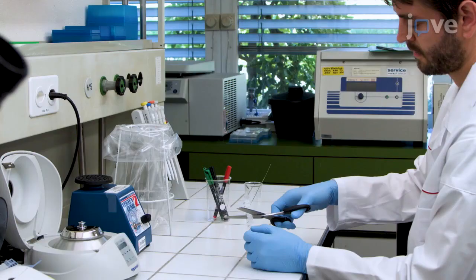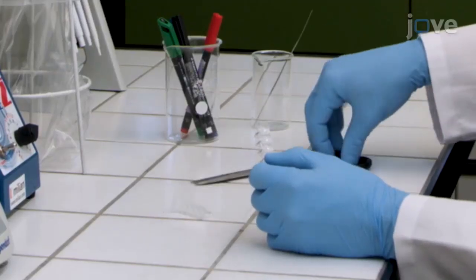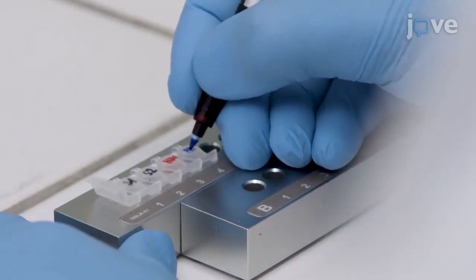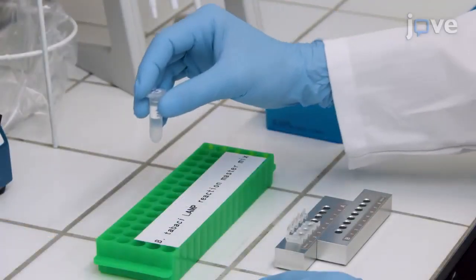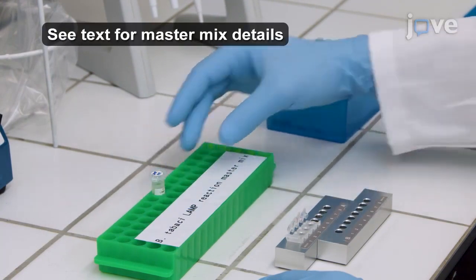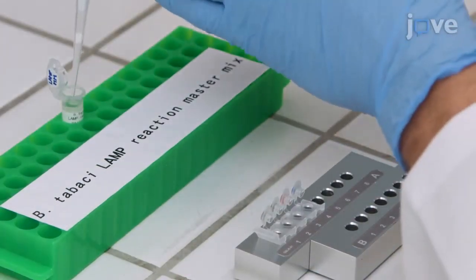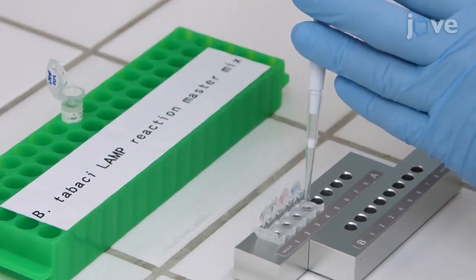To begin, use scissors to cut an 8-tube lamp strip into two 4-tube lamp strips. Then label the tubes according to the scheme outlined in figure 1 of the text protocol. After this, prepare enough B. tabaci lamp reaction master mix for 80 reactions. Then dispense 22.5 µL of the master mix into each of the tubes of the 4-tube lamp strips.